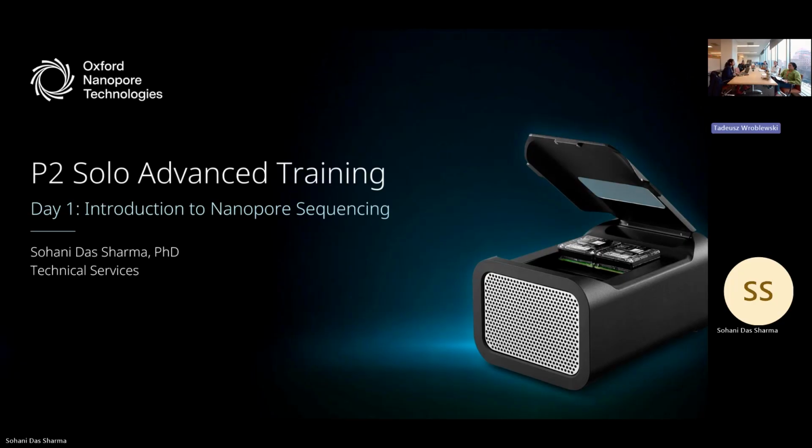A little bit about P2 Solo, how we can do the software check, what the software is, how the base calling is happening, and about sequencing, how we can do it and monitor the run. So today it would be a very preliminary tech talk regarding the Nanopore chemistry, the library prep, and what we can do with this platform. At the end of today, we'll have some idea how the sequencing run is taking place, and based on that, we can plan tomorrow.